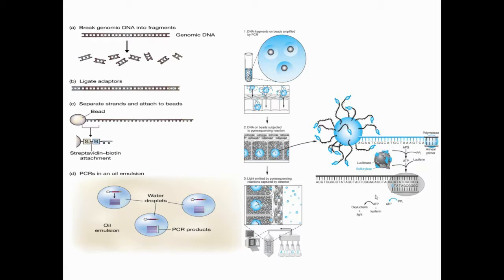So every time they add one deoxynucleotide, in like 96 wells, you add one nucleotide to the plate, and then the computer detects the signal in which well. After that they wash and add the next nucleotide, and the computer continues to record the signal from the well. They just repeat these 4 nucleotides, and they perform like 150 to 200 cycles, all right?